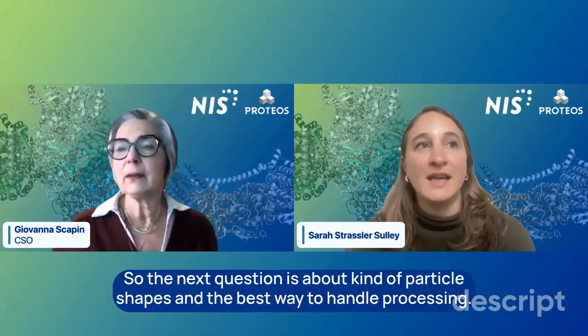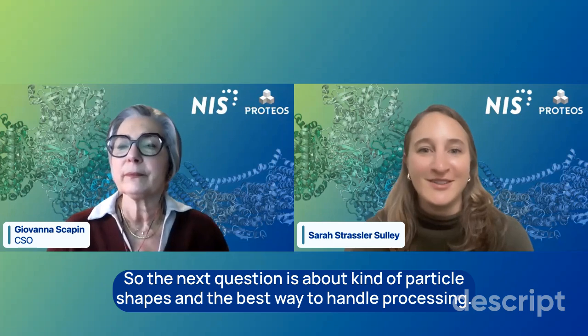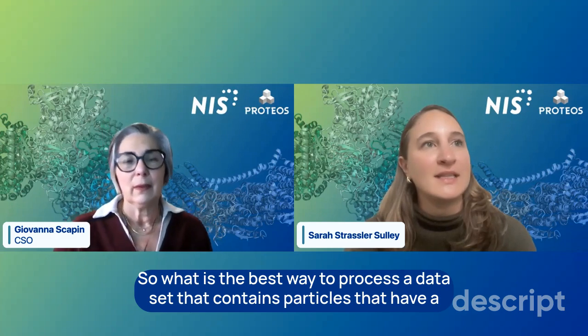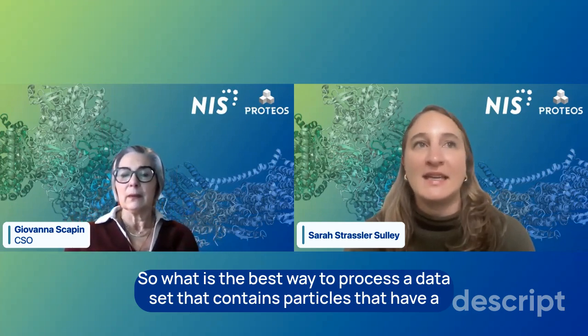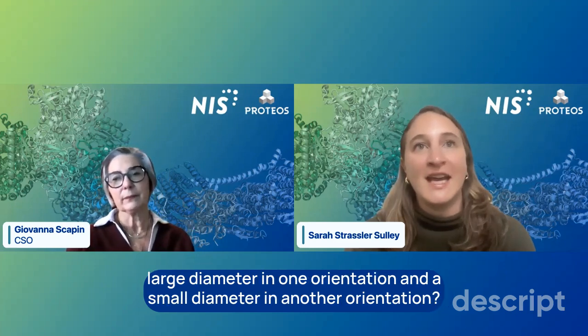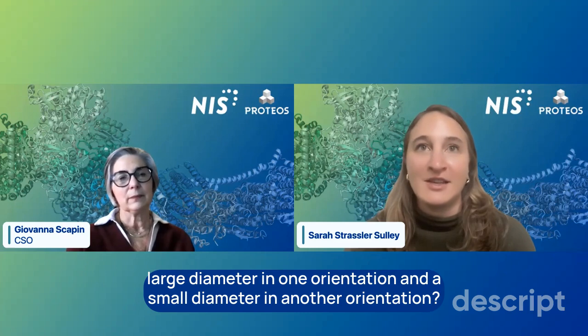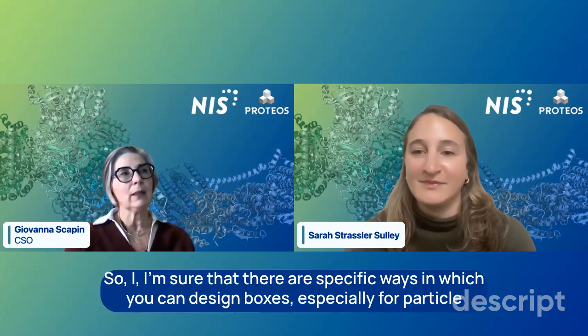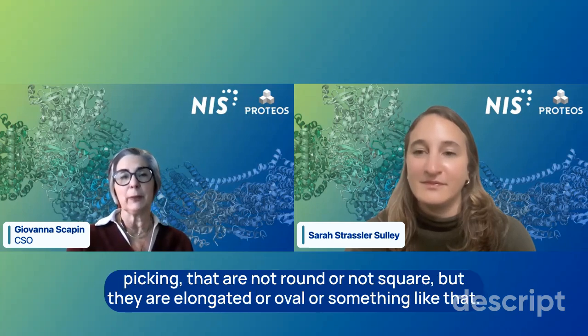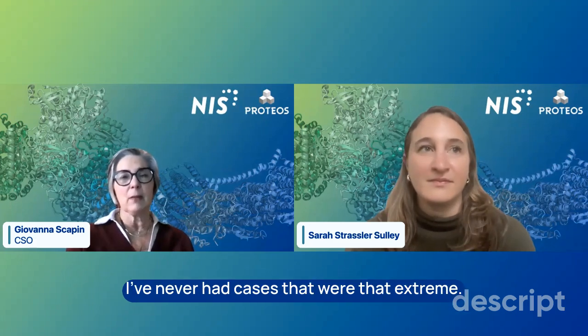So the next question is about particle shapes and the best way to handle processing. What is the best way to process a data set that contains particles that have a large diameter in one orientation and a small diameter in another orientation? I'm sure that there are specific ways in which you can design boxes, especially for particle picking, that are not round or not square, but elongated or oval or something like that. I've never had cases that were that extreme.